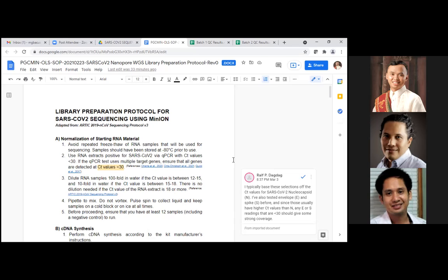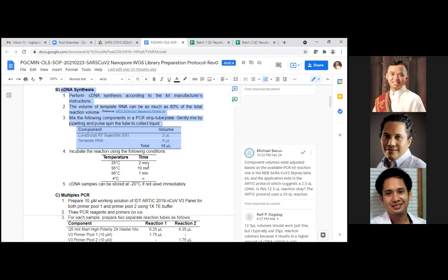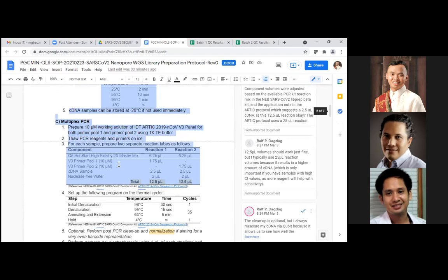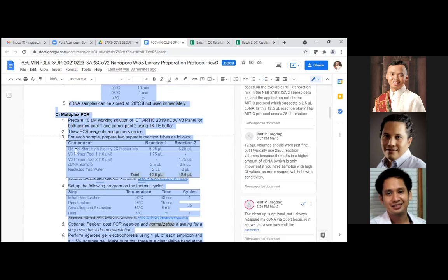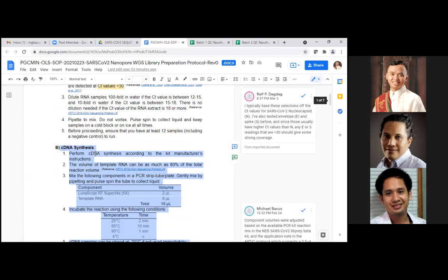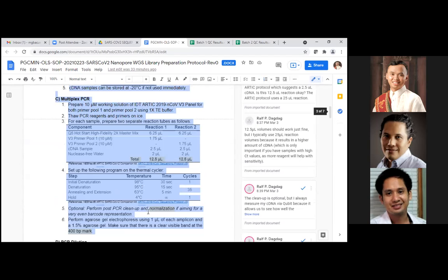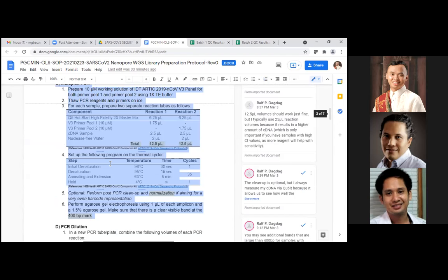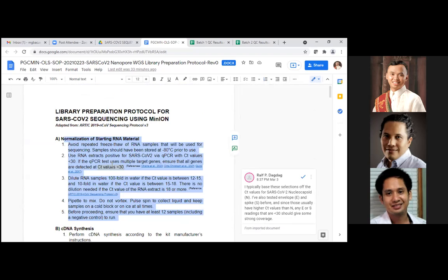And how long is it to execute all this up to generating the sequence? So in our experience, we allot 1 day for the enrichment. That means from cDNA synthesis to multiplex PCR and the gel and Qubit quantification. So this one, from part B to part C, we allot 1 day for this. So when we do retesting, we do it another day before. Okay. Yeah.